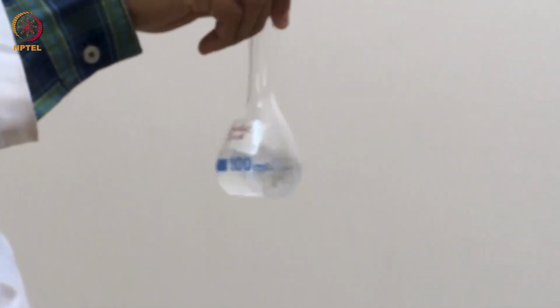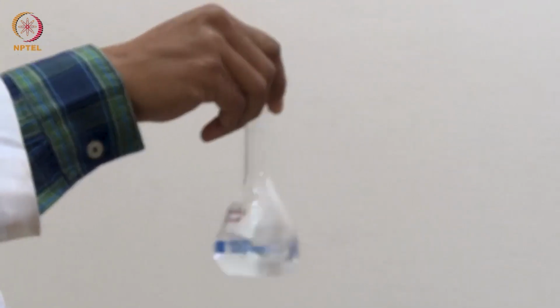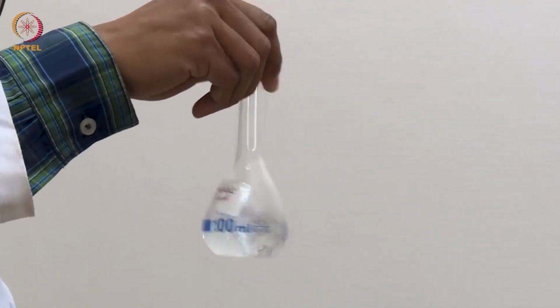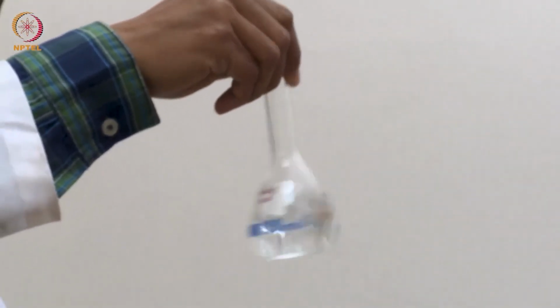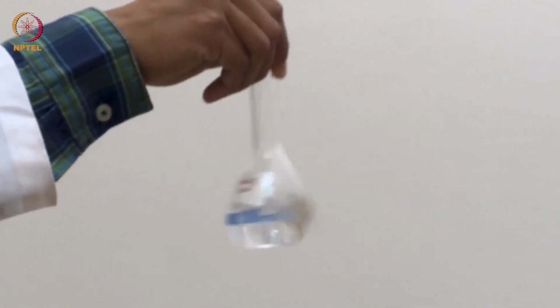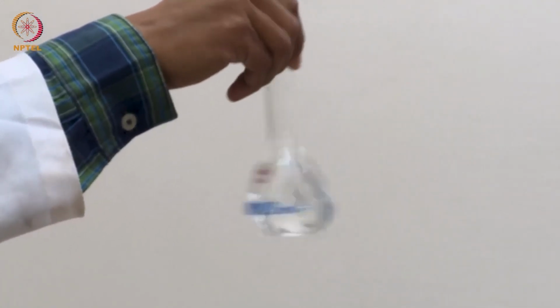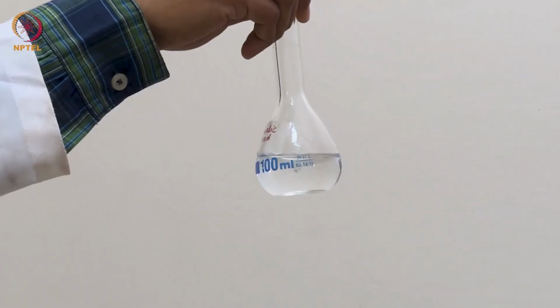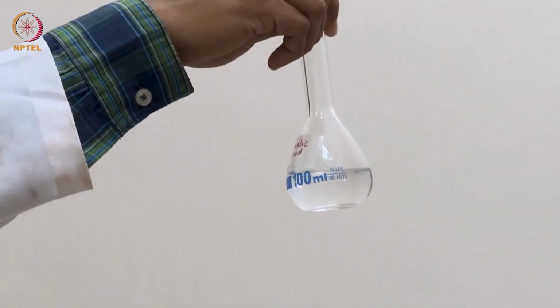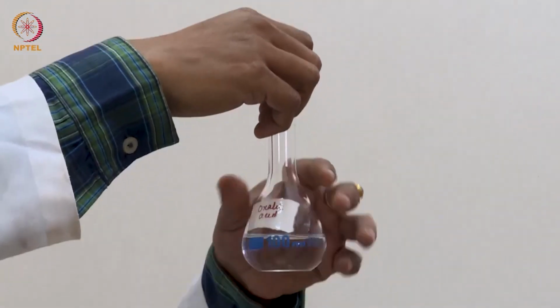By careful shaking, one should dissolve this oxalic acid completely before making up to the mark. So, one should take care of complete dissolution before filling this volumetric flask. So, now you can see that the acid has completely dissolved, there is no floating particle.